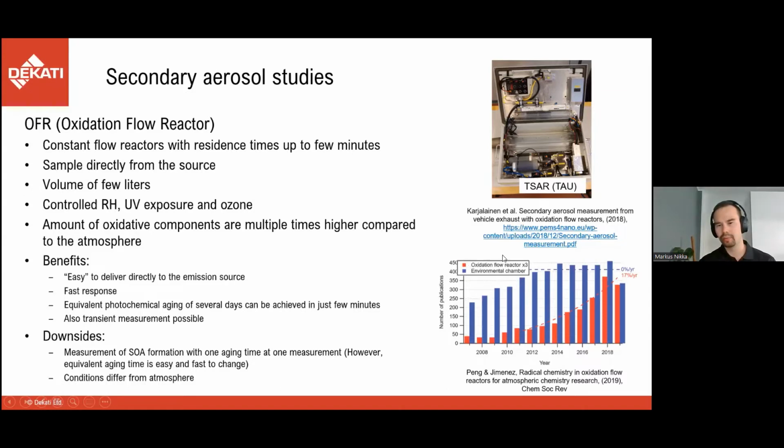It has to be noted that the number of OFR publications is multiplied by 3, so there are still quite a lot more publications coming with the smoke chambers, but you can see that the number hasn't really increased during the last years. However, there's a significant increase in the number of publications where OFRs have been used.